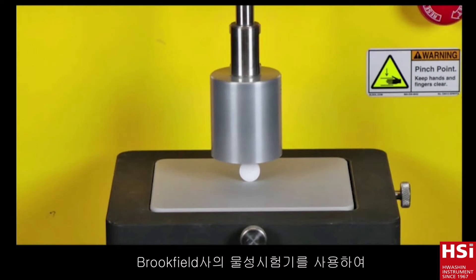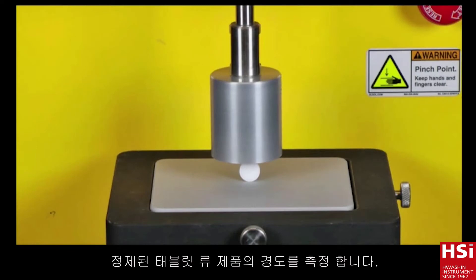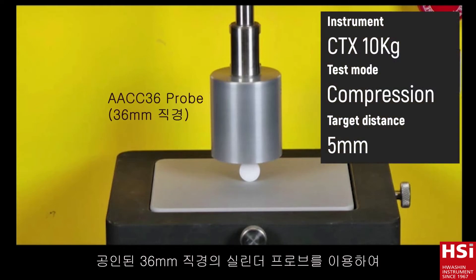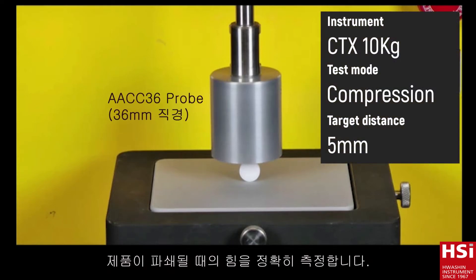This is a tablet diametric compression test using the CT3 texture analyzer. This test utilizes a cylinder probe to measure the force to crush a tablet.